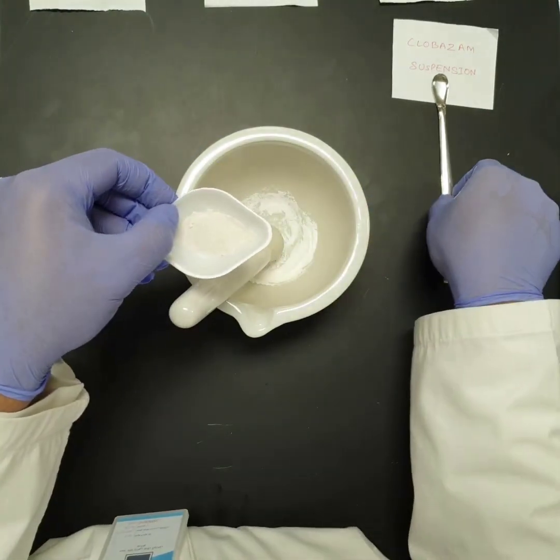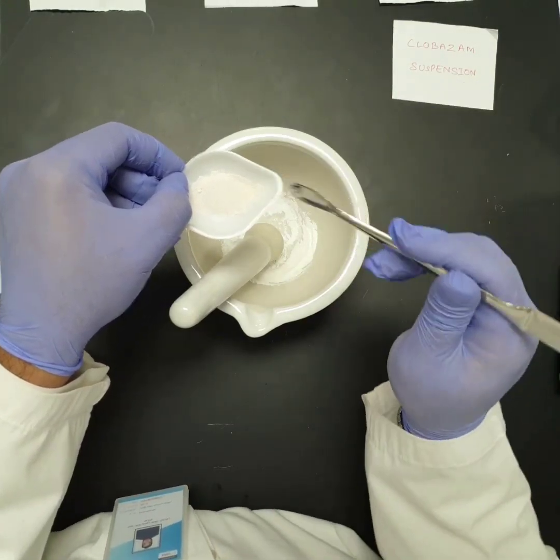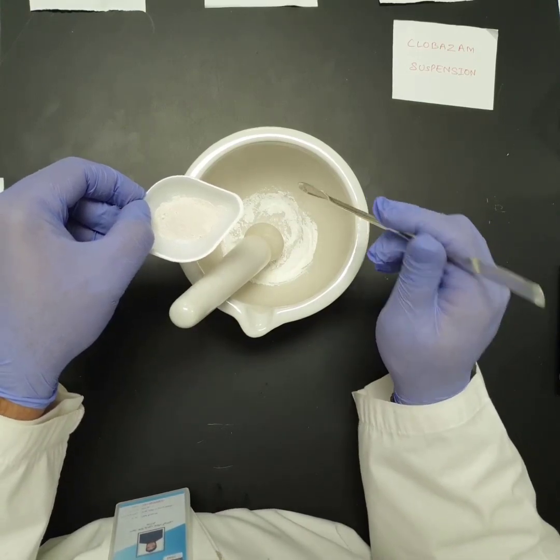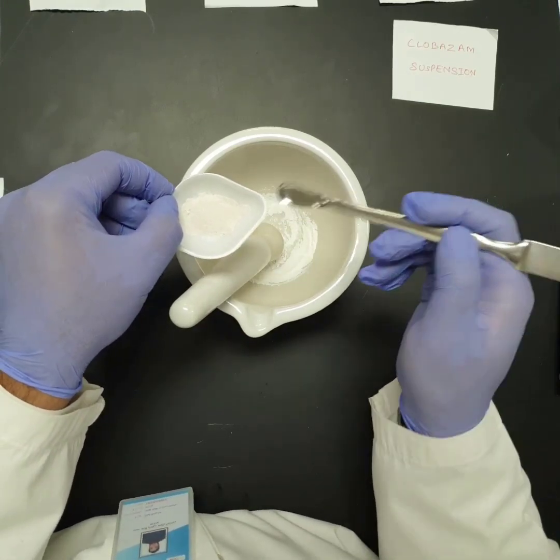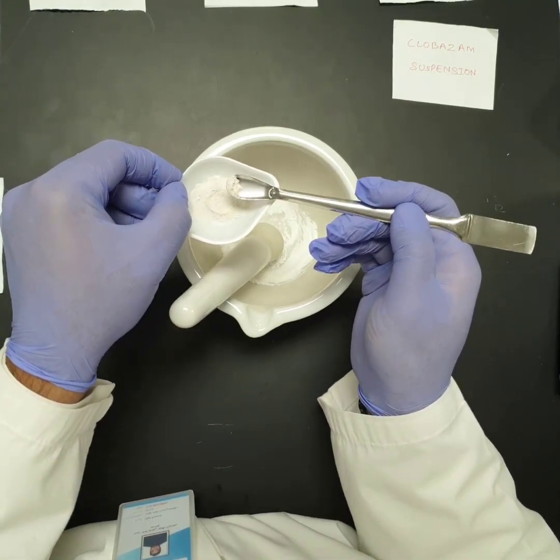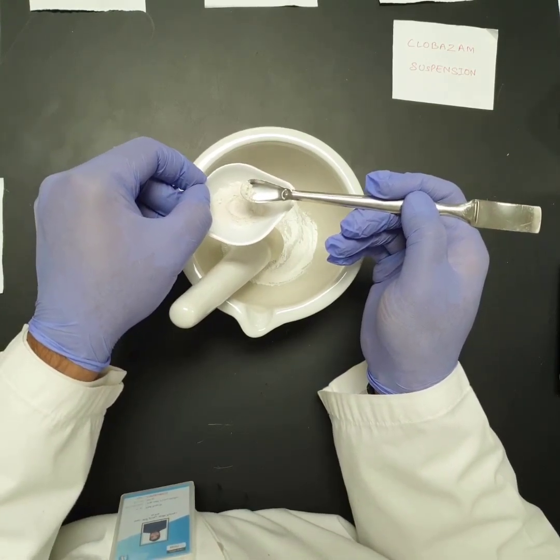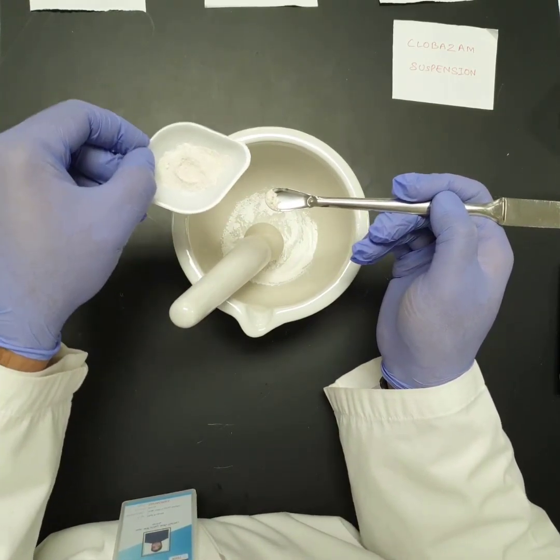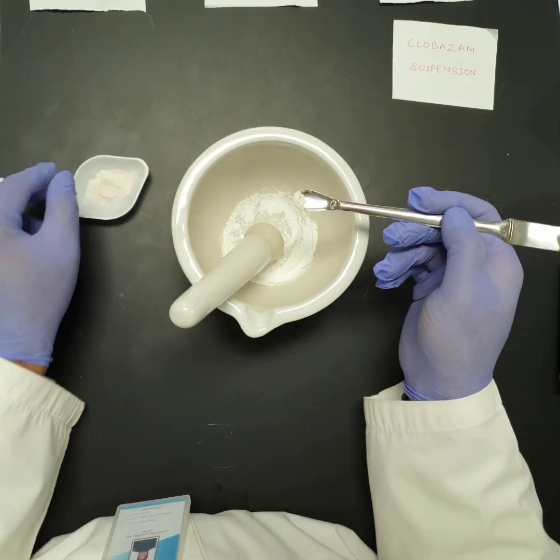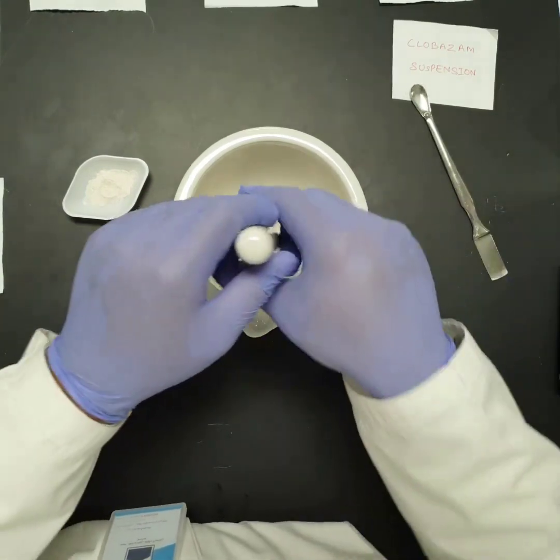If I am going to use this geometric mixing technique, I have to add the same amount which is there in my porcelain mortar. In the porcelain mortar, I have only 100 milligram. So I am going to take 100 milligram from this weighing pan of suspending agent. I am not going to measure or calculate accurately. I am just randomly, by guessing, going to take this amount. So now it's time for me to add a little amount of the suspending agent, and I am going to mix this.